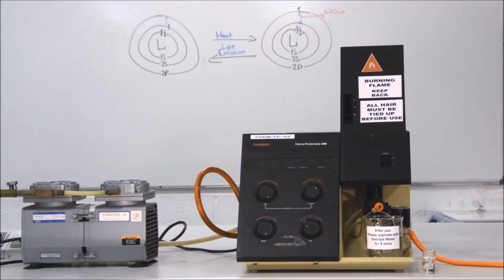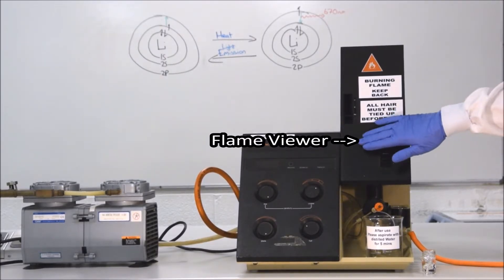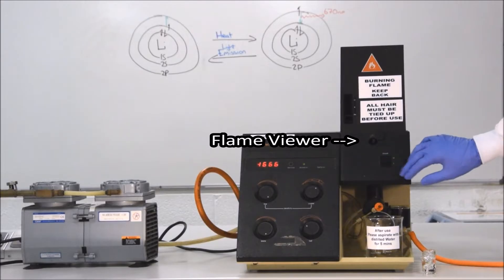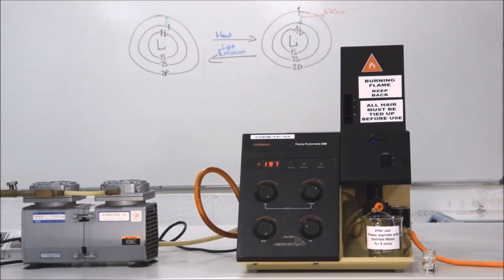The on-off switch allows us to turn on the machine. But before we do, we want to be able to see that the flame ignites. So the first thing that we do is we open the flame viewing window. Once we're happy the flame has ignited correctly, we can close the viewer and we can start using the machine.